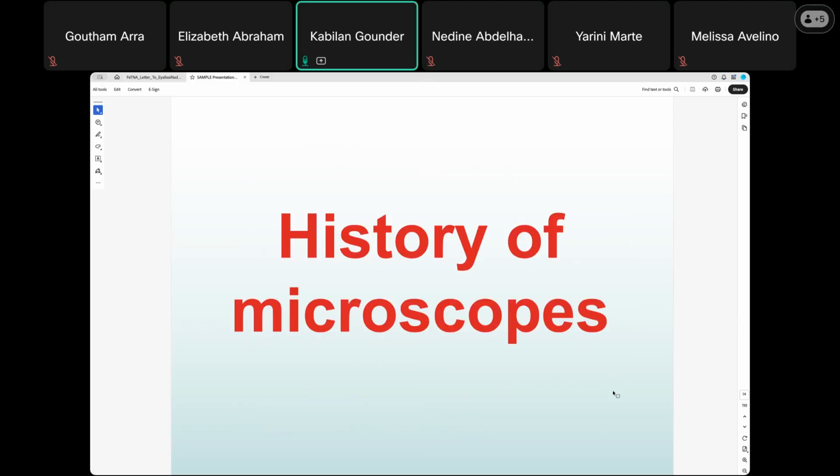So overall, our goal next is to learn about what a microscope is. Before we go into the details, we will look at how the microscope evolved from the basics to advanced, now with AI, artificial intelligence.